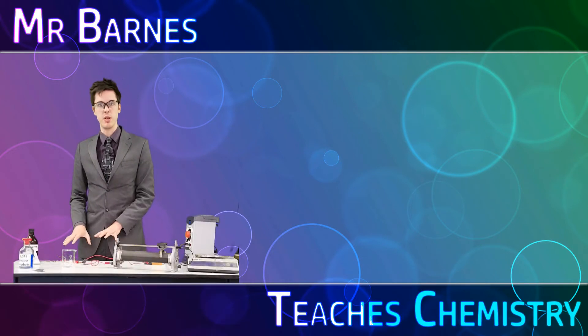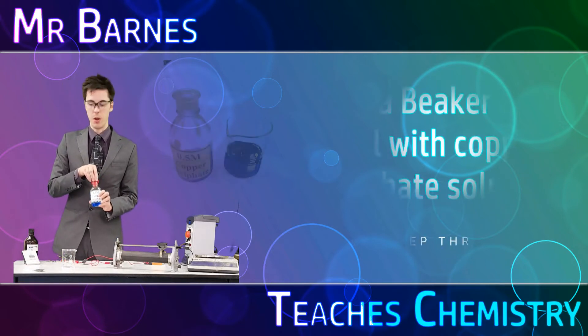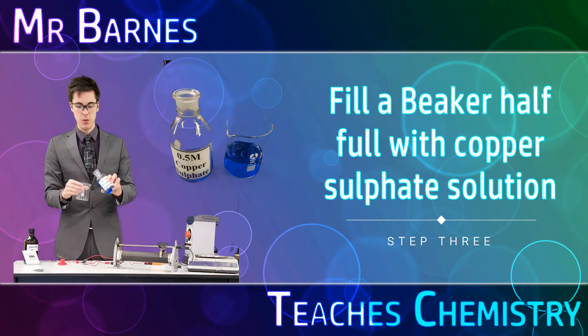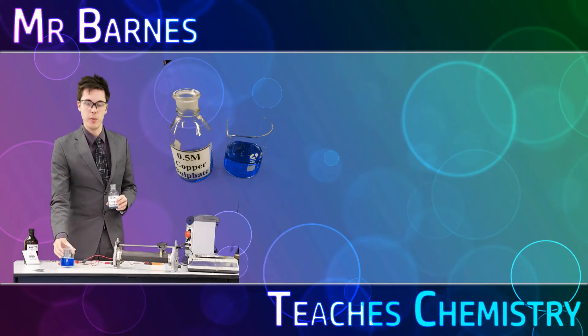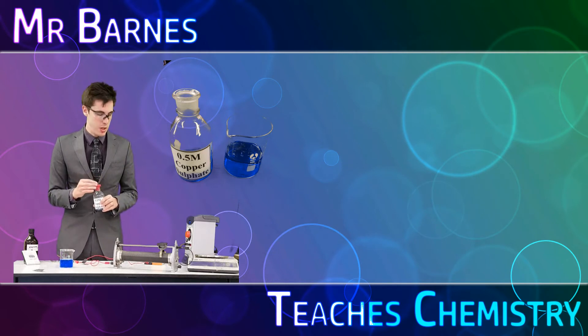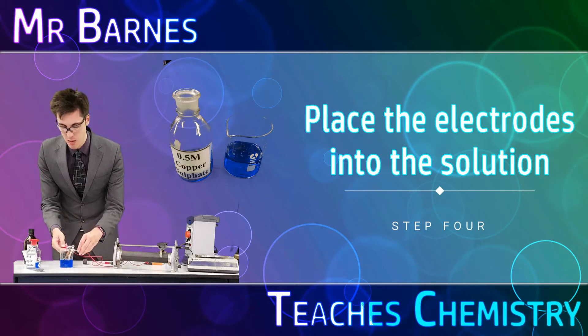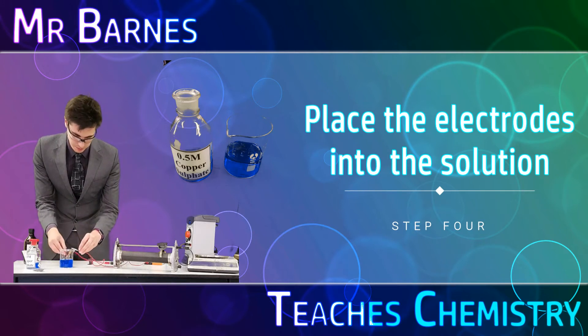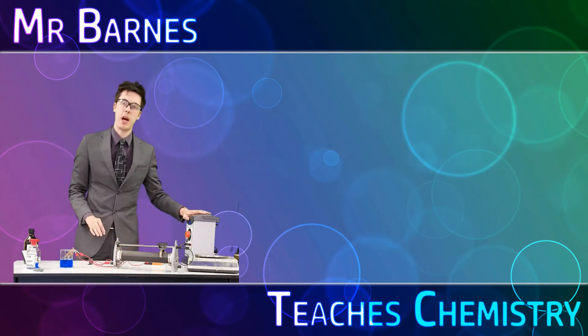Once you've measured your electrodes and got them set up ready to go into your solution, the next thing you want to do is get yourself some copper sulfate solution and put it into a beaker so it's about halfway. Once you've done that you're ready to go with the experiment. Place your copper electrodes into the solution making sure they're not touching, and then turn your power pack on.